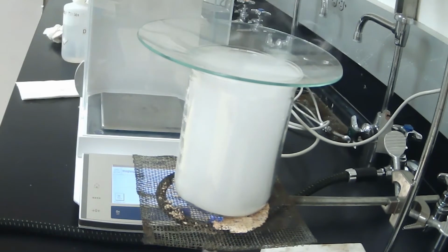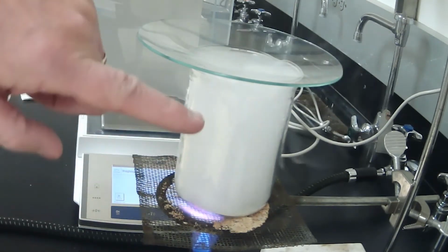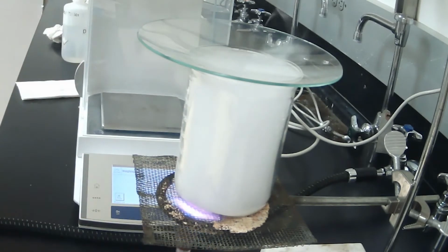Alright. Now you're going to see through the video that the white is starting to cake along the sides and get more and more opaque with it. And that is a good sign. That's what we want to see. We want to see the ammonium chloride re-solidifying up on the sides and on the bottom of the watch glass. So what I'm going to do now is I'm going to hold it on the side that's closest to you.